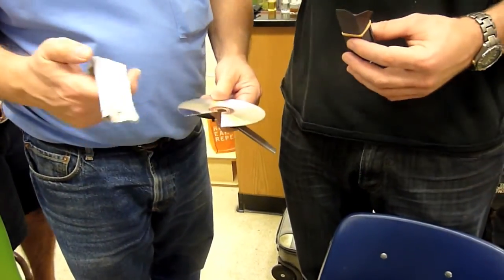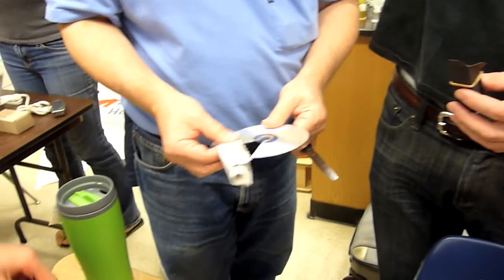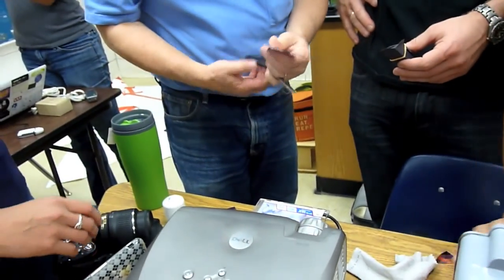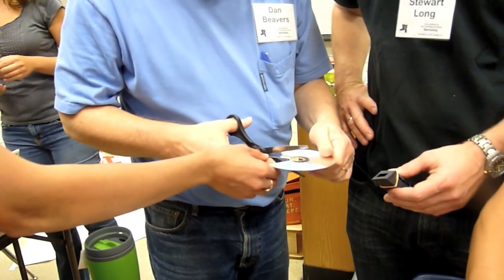You want to get the sun, actually. You want to try to look through the atmosphere and not through that. Then look through, get it lined up. This is the other issue. Make mistakes, actually. Spectral Workbench will correct it for you. Take a baseline, and it lets you put it in.